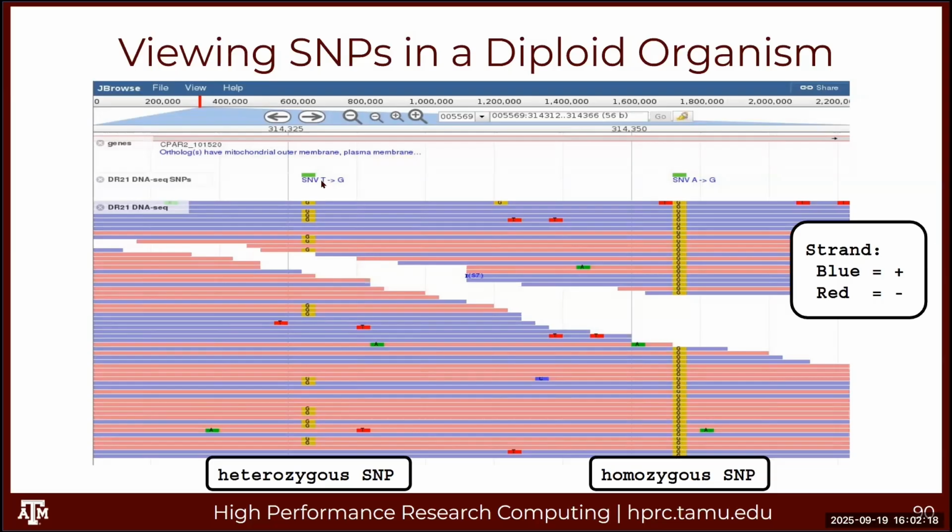And the reference, it's a T. So up here it's a T, but our sample has a G here. So it shows you the variant. It goes from a T to a G, and this is from an A to a G. Now you see these other ones scattered across here? Those are just sequencing errors. Since there's only 1 copy out of all of these reads, it's not going to say this is a SNP. This is a sequencing error, so it doesn't call it. So that's why we don't see the variant called in the VCF file.